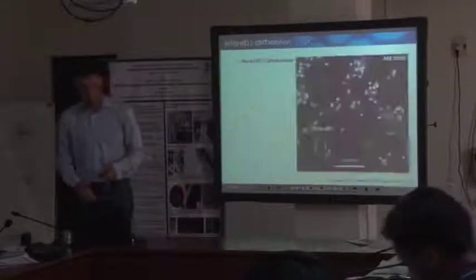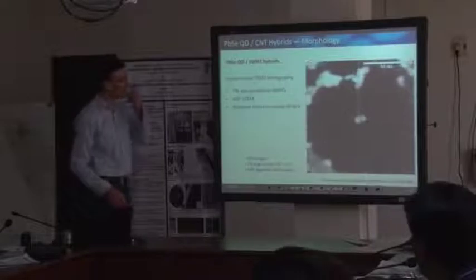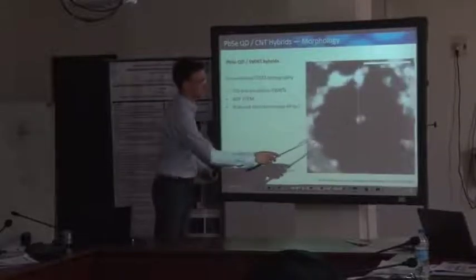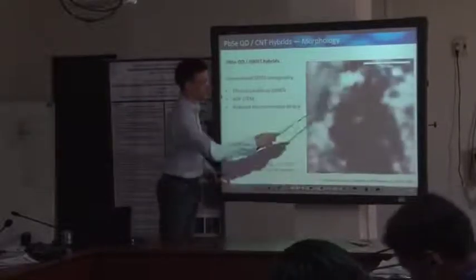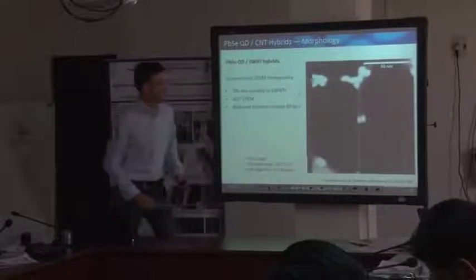This is the reason why Benjamin applied electron tomography, and this is only one exemplary particle. You can simply imagine that those particles grow around the nanotube somehow, and this is what you already see here. So this is the nanotube strut, and this is the lead selenide.